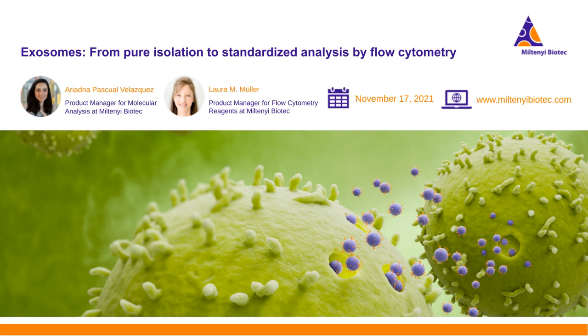So we have a rather specific signal, and of course, you do the usual cleaning routines you would do for a cell analysis on the flow cytometer. So the same cleaning as you do in your routine work on the flow cytometer. There's no special cleaning required because we do not analyze single EVs.